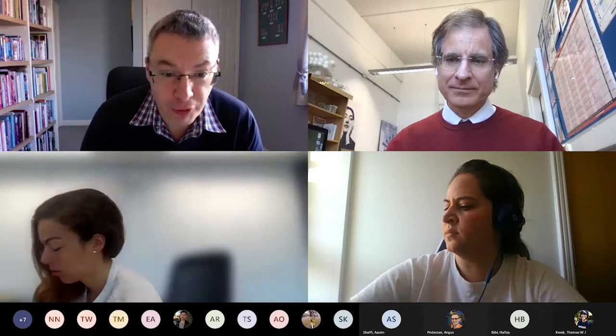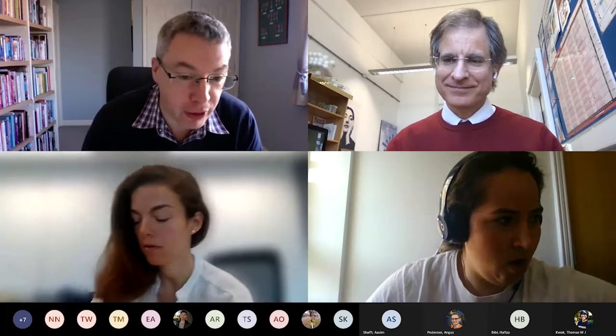So we're going to kick off, and it's a great pleasure to introduce David Power from CrystalMaker, who is behind the software, developed it, markets it, runs these courses for us, etc. David has spent many years developing the CrystalMaker software to explore crystal structures and visualization of crystal structures, as well as looking at their diffraction data and so on and so forth.